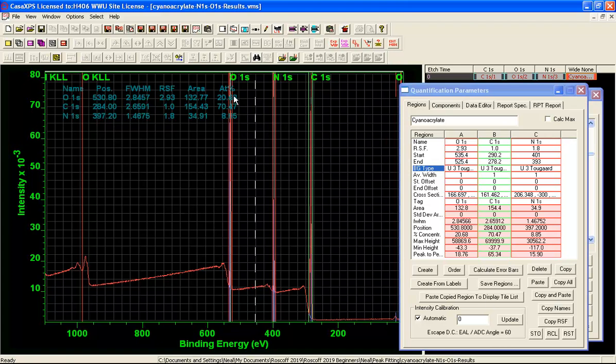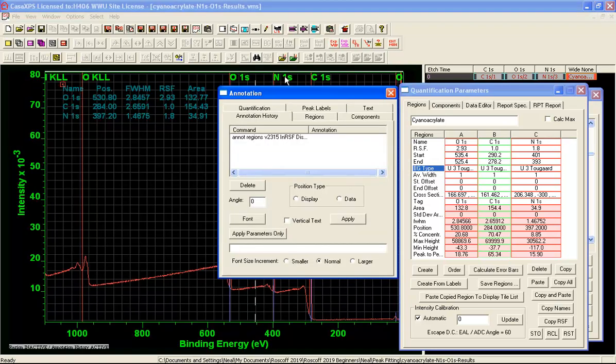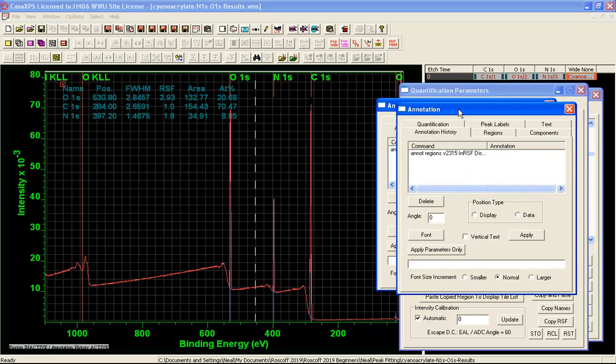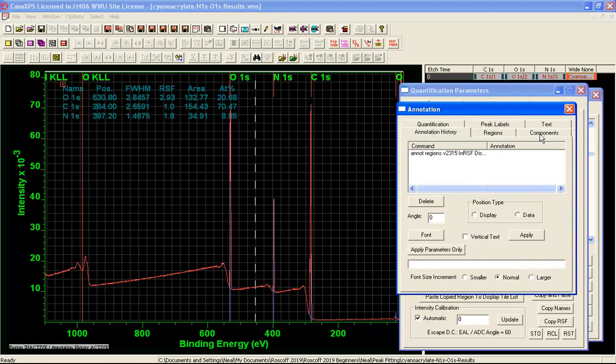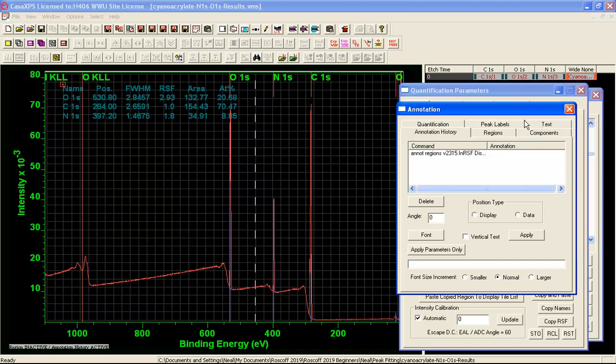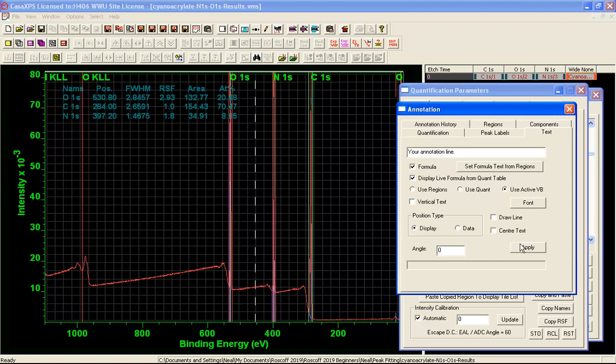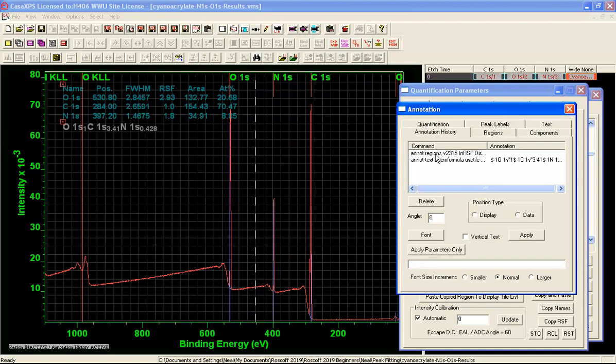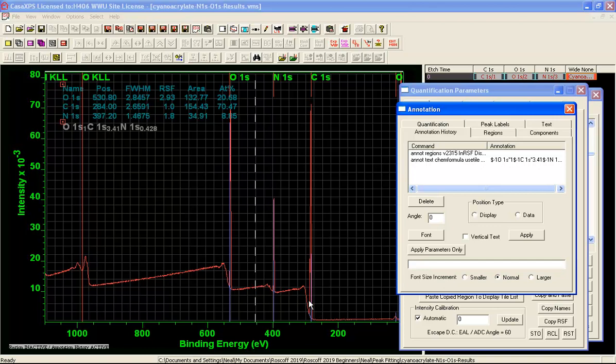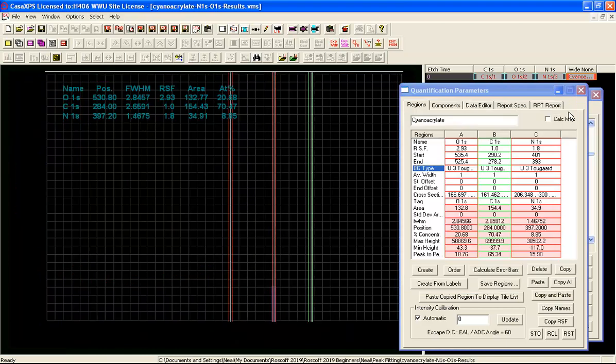So we now have an atomic concentration indicating the amount of these materials. So rather than simply relying on the atomic concentration to understand the relative proportions I can use a text annotation where I am going to select the formula and I am going to display a live formula and we will use the active VAMAS block. In other words data that is shown here in the active tile will be used to create the ratio formula that will now appear when I press the apply button.